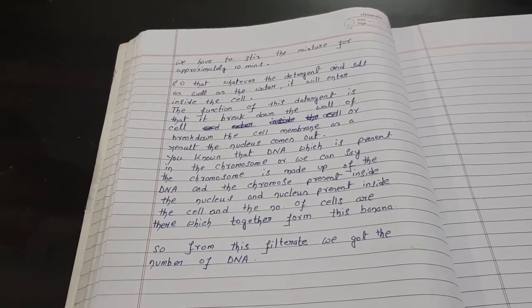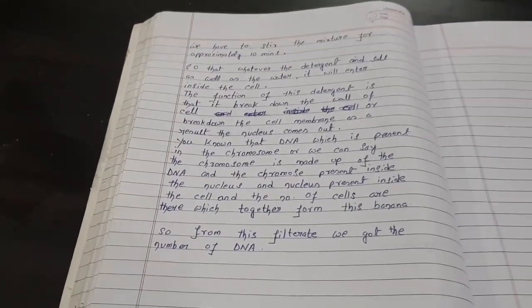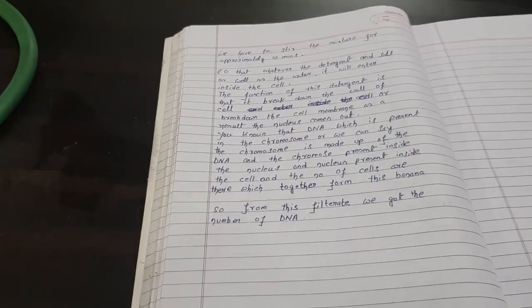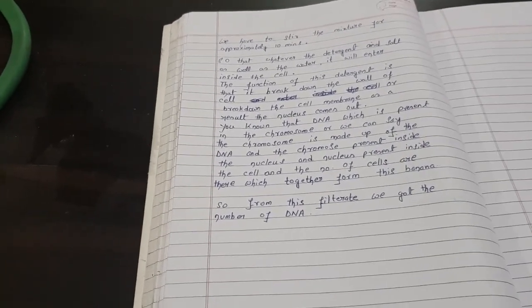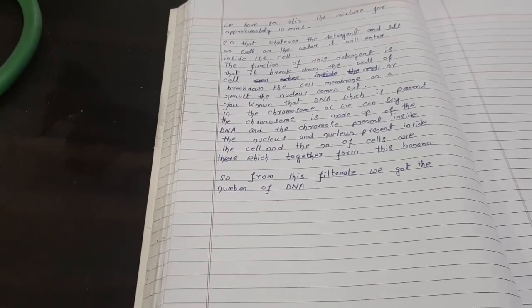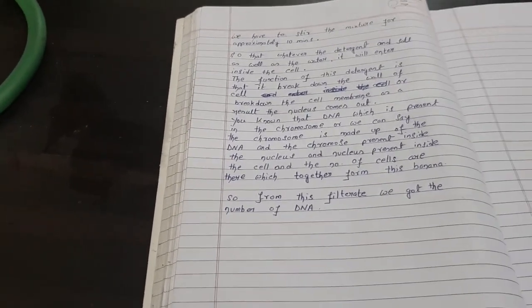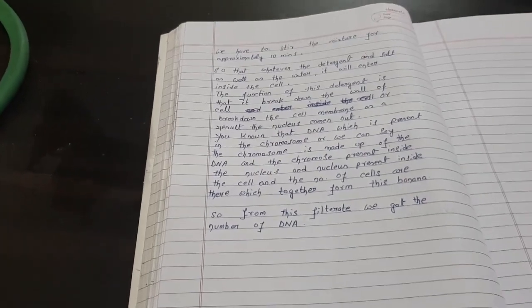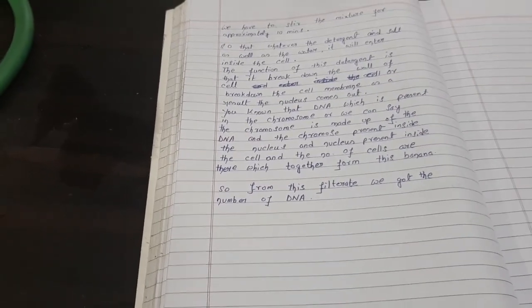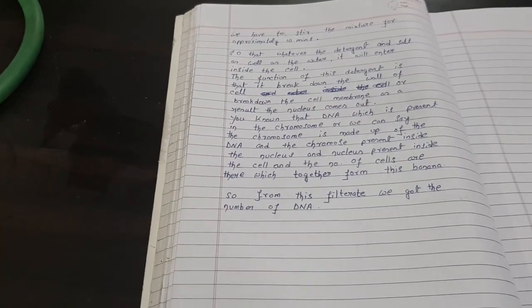We stir for 10 to 15 minutes so that the detergent, salt, and water enter inside the cell. The function of the detergent is that it breaks down the wall of the cell. If we break down the cell membrane, the nucleus can come out. If we break down the cell membrane of the banana, the nucleus will come out.